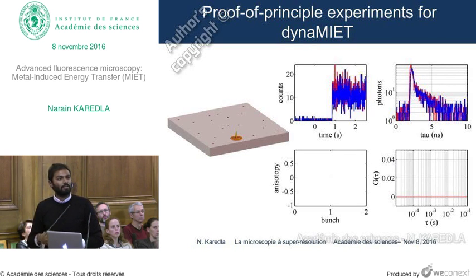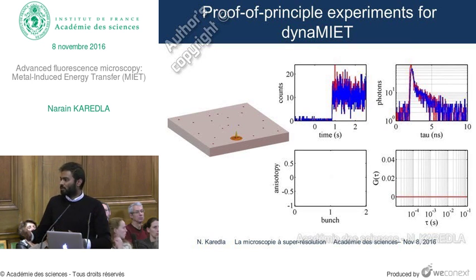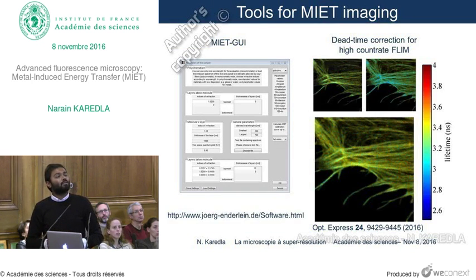And this, for example, is the data from one successful point. And in principle, you average over all the points that you collect. So with that, I come to the last slide. We are also now providing tools for MIET imaging.